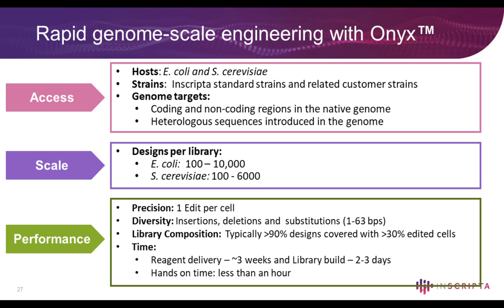In terms of the genome access, you can see from all the examples that I've shown today, you can access both the coding and non-coding regions in native genome and heterologous sequences. So if you've introduced heterologous sequences, you can access both the heterologous sequences and the native genome to scale your study of the biological system you're interested in.